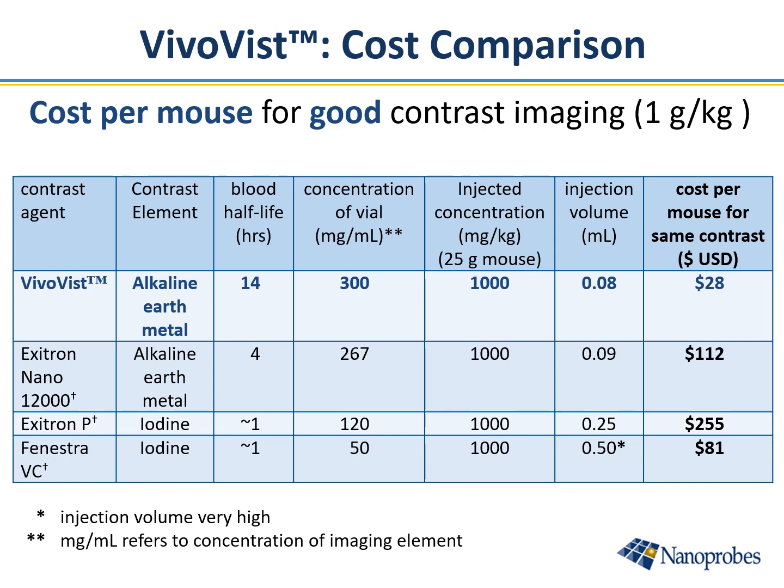As you can see, it provides the longest blood half-life out of this selection of contrast agents and the highest initial concentration, which means that for the same injection volume you'll achieve a higher contrast within the specimen, and that provides a higher maximum contrast.